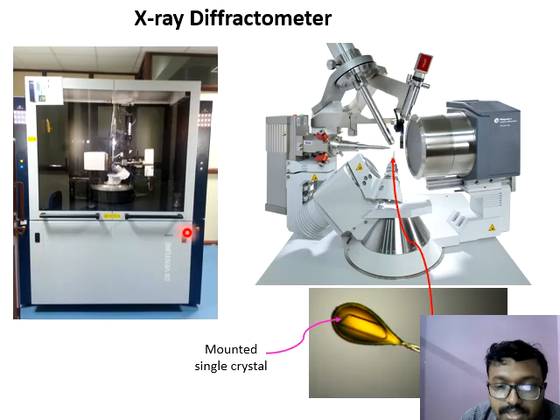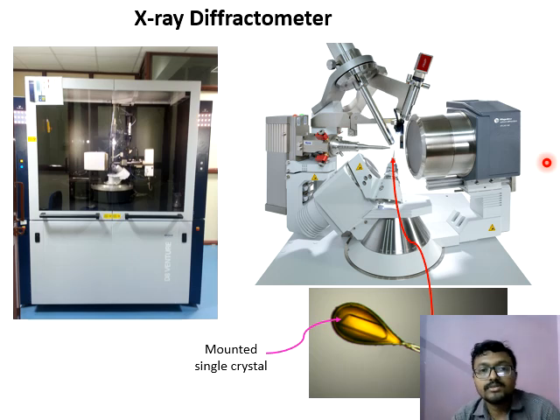This is the picture of the X-ray instrument. Inside the instrument we mount the crystal, and then the X-ray radiation comes and is reflected. So this is all about the XRD technique.